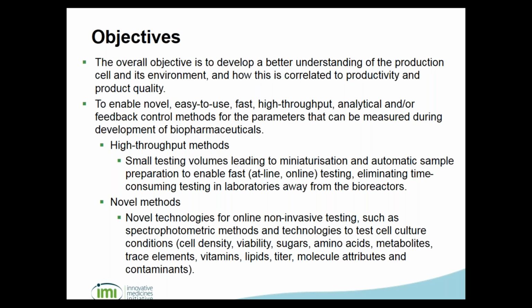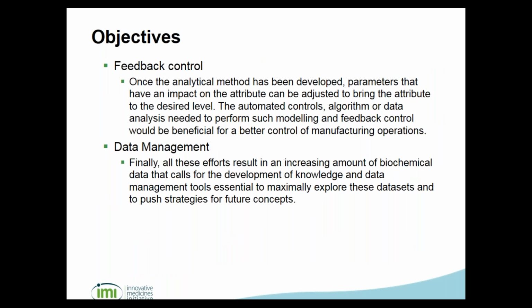how the cell culture conditions are, and looking then at cell density, viability, amino acids, trace elements, vitamins, because, for example, for the amino acids and the vitamins, we still have to take a sample, we have to go to the lab, we have to put it into an HPLC to measure those vitamins. So if you really want to take in situ samples, then there's definitely a lag between the time that you're taking the sample and the time that you are measuring the values of, for instance, the amino acids. Next slide, please.